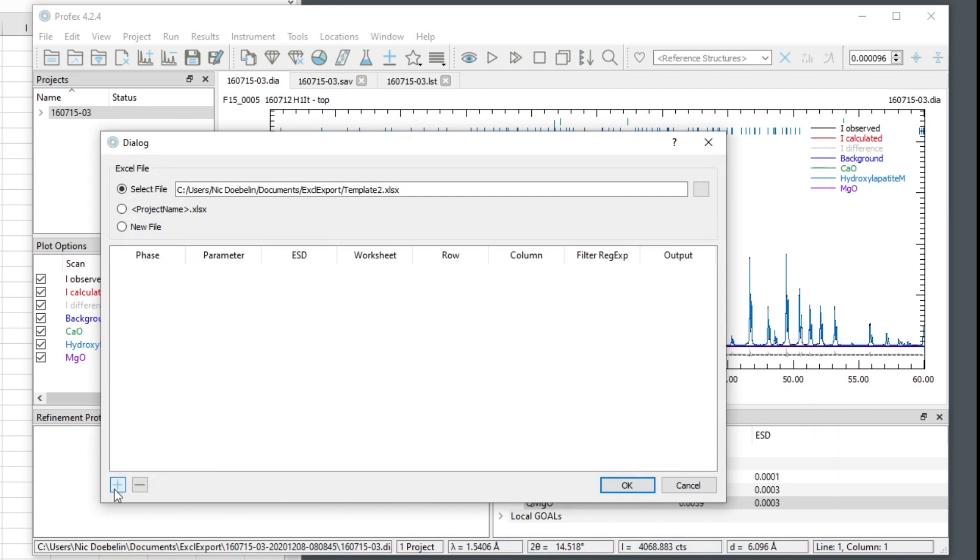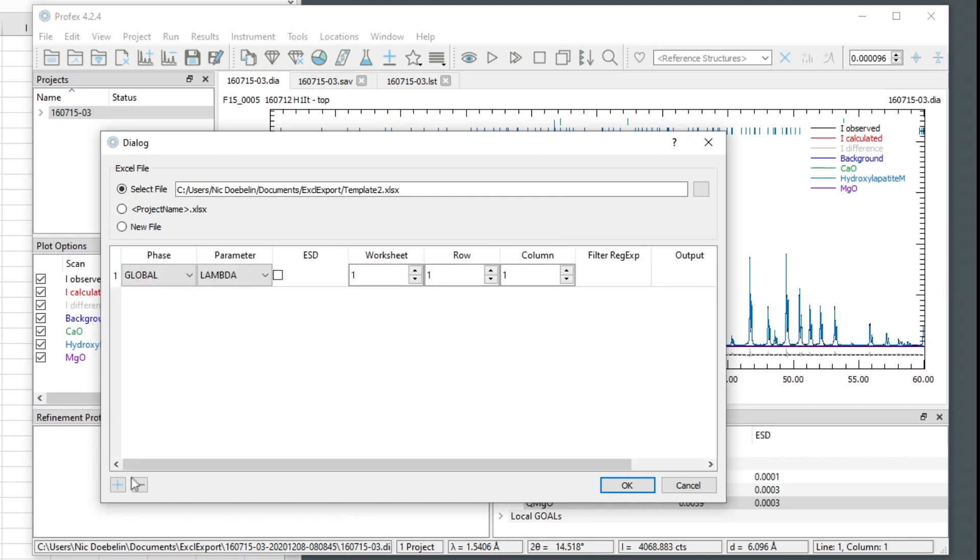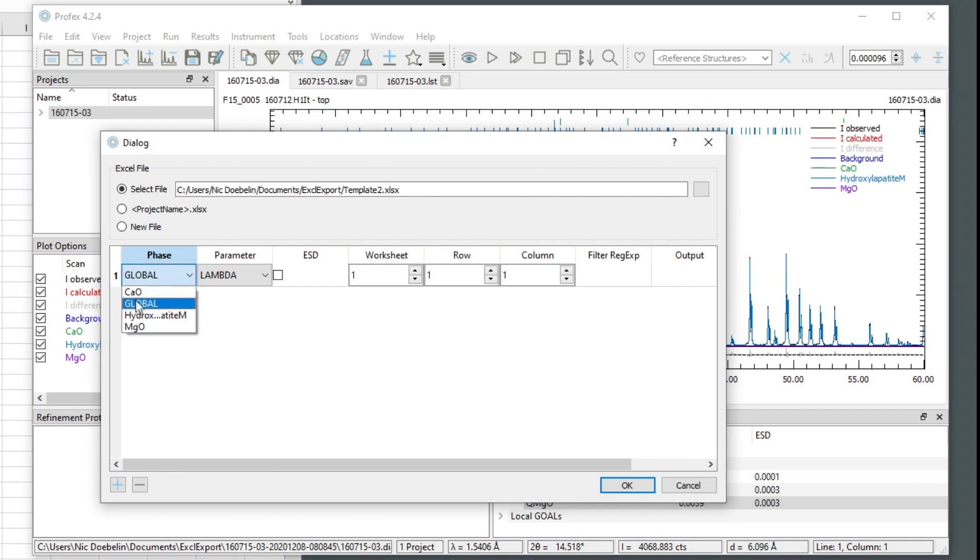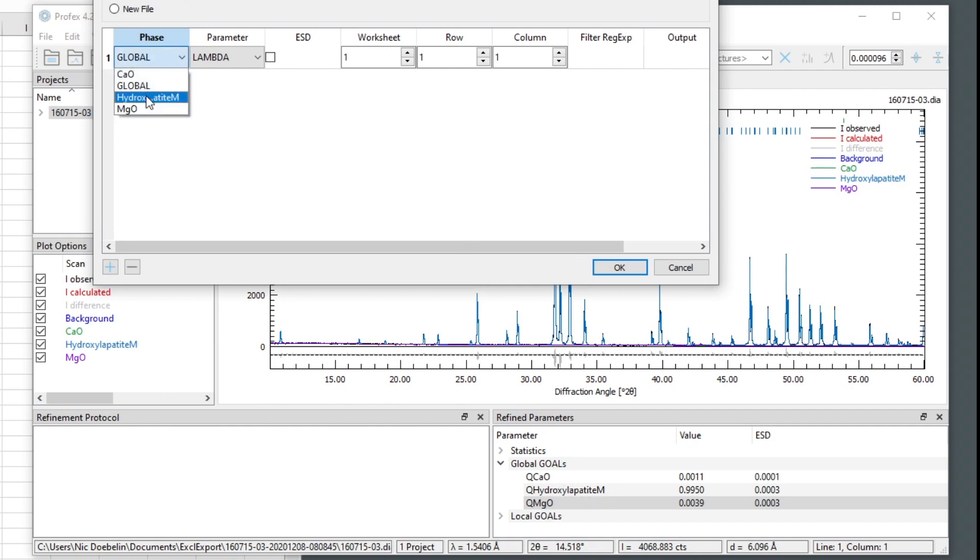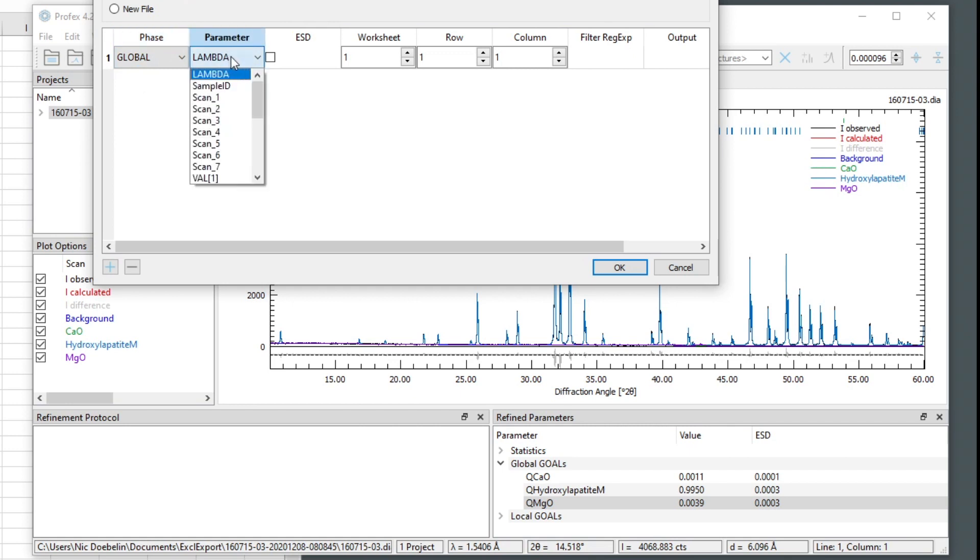So for every result, we have to add one line to the table. And we can choose between global parameters, or local parameters for all the three phases that are refined in this project. So we have the calcium oxide, hydroxyapatite, and magnesium oxide, or global results. And the sample ID is a global result. So we select global, and from the parameter, we select the sample ID.